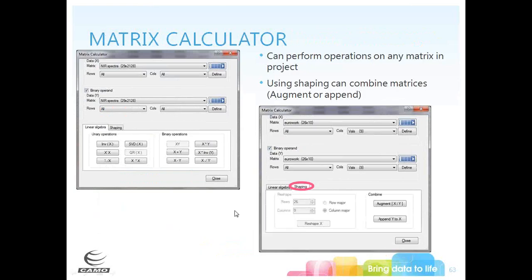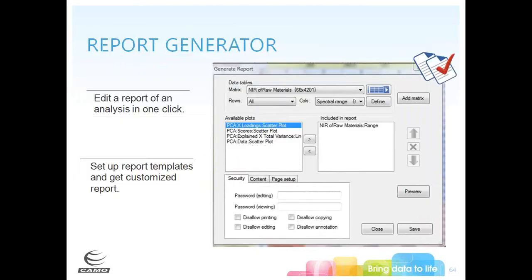The matrix calculator enables you to perform linear algebra operations on a single or two matrices within a project. The shaping function allows you to augment or append one matrix to another, helpful for combining data imported at different times or fusing data from different measurement types on the same samples. The Unscrambler X also has a report generator that creates a PDF report with plots included, customizable with templates and your company logo.